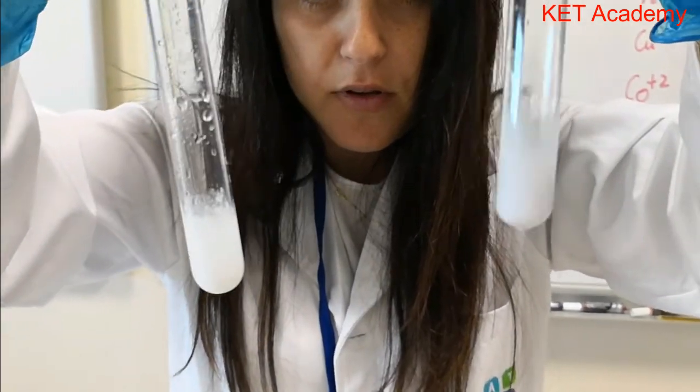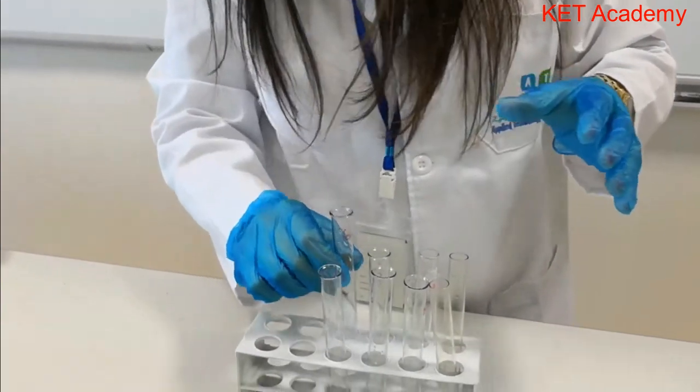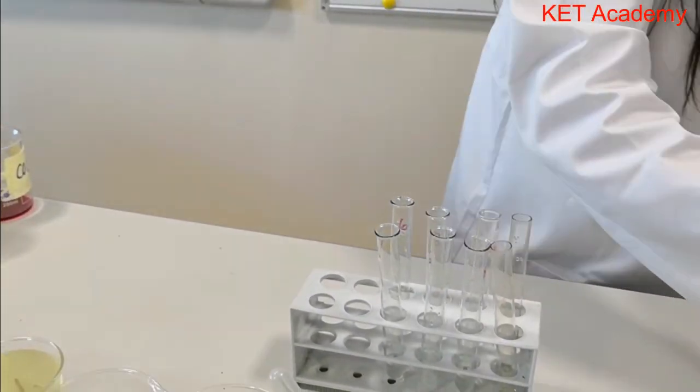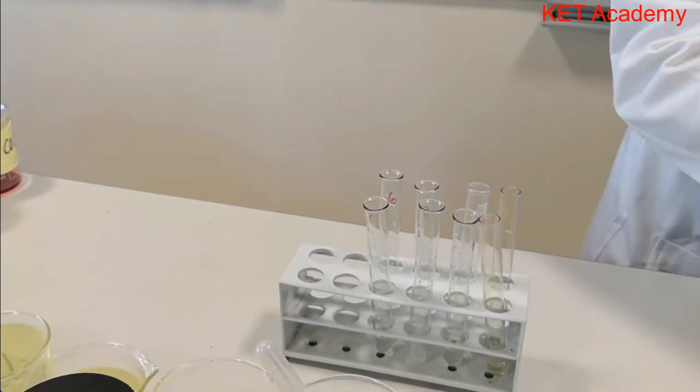In the laboratory, it's a very normal activity. Don't panic in the lab. Just follow the instructions carefully. Wear your goggles, if possible. Wear your gloves, your face masks, and I think you'll be good to go.